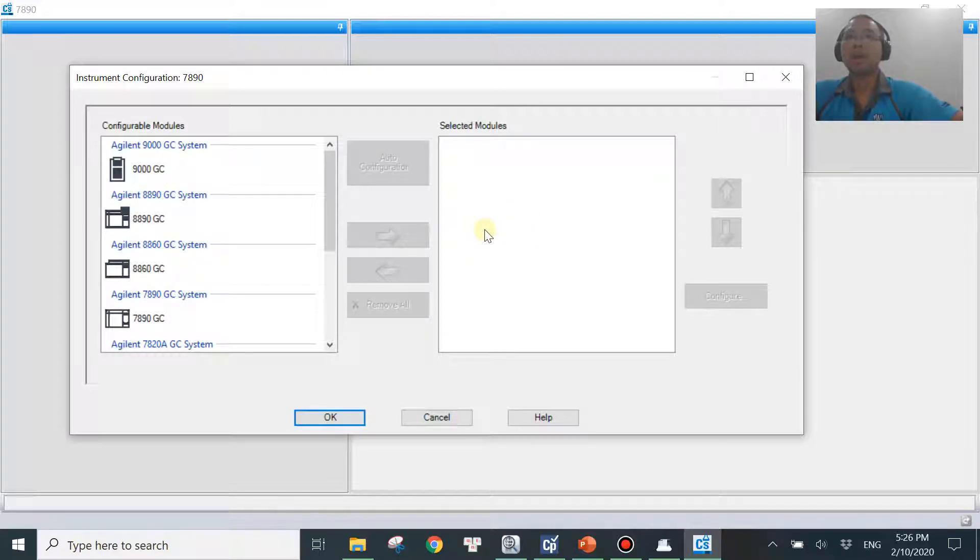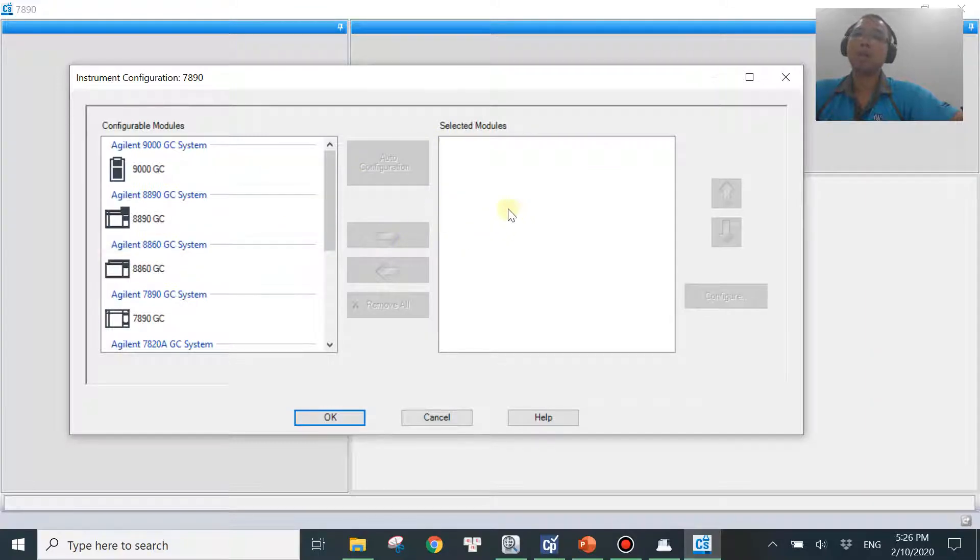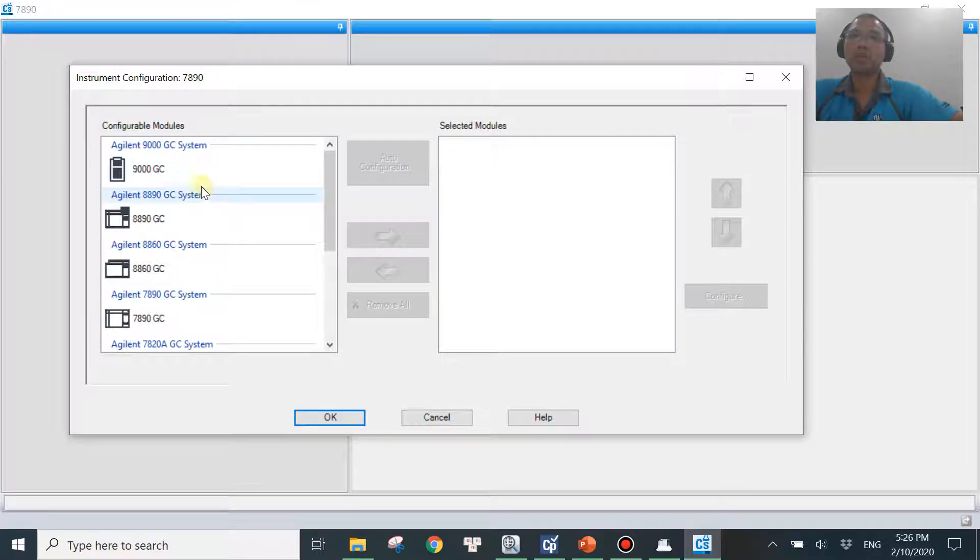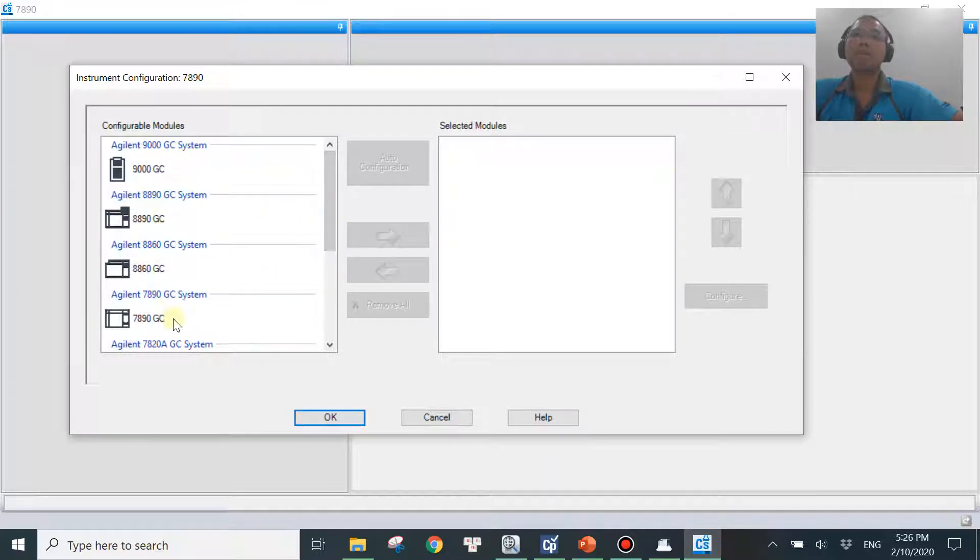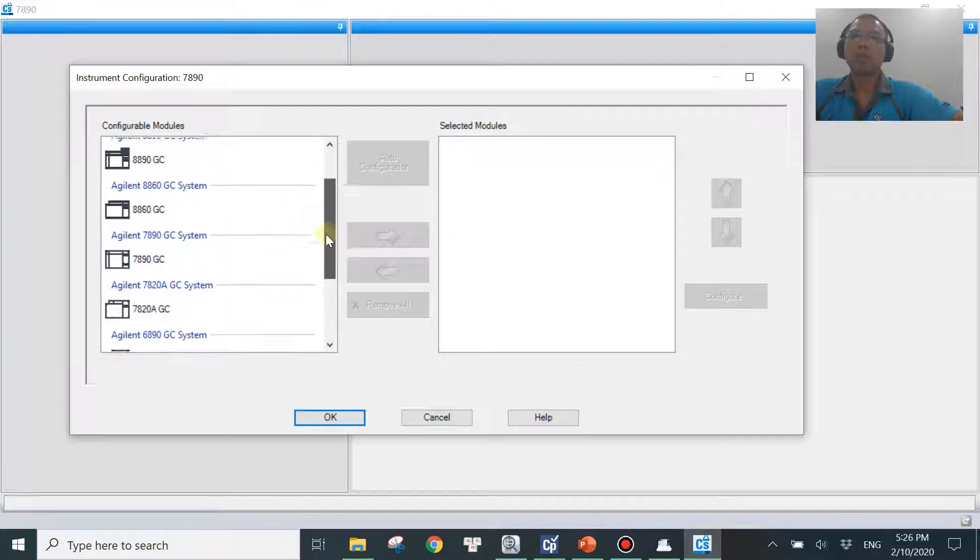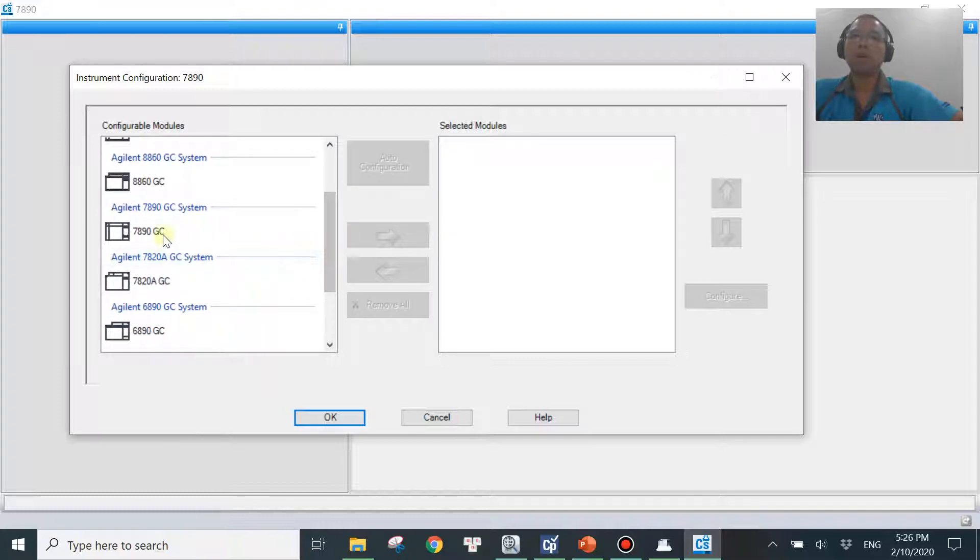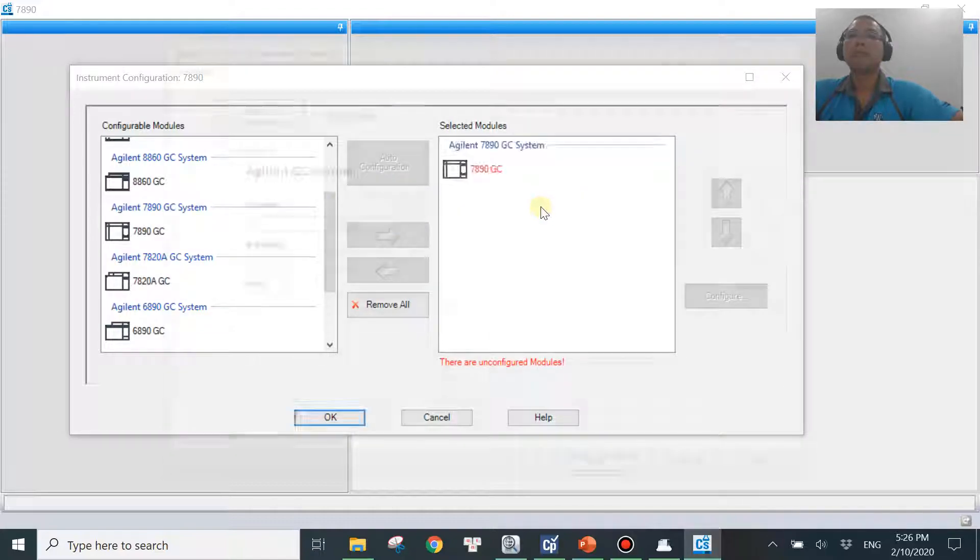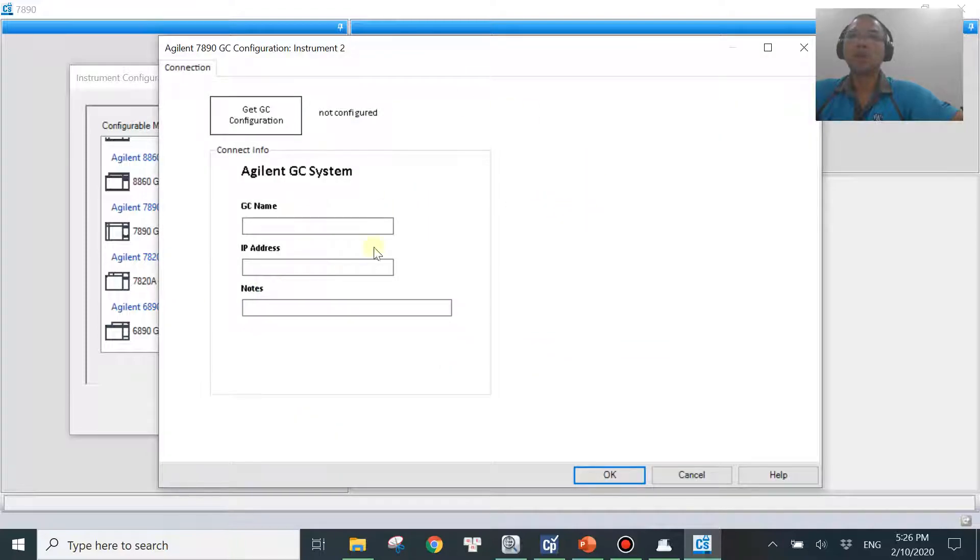And depending on which version you are using, the window might look a little bit different, but it's more or less very similar. You just need to look for your instrument from the left side over here. The name may be a little bit different, but you should know. I think you will know which one. In my case, that is instrument 7890 GC over here. I want to move it over to the right side. And then a new window will pop up like this.